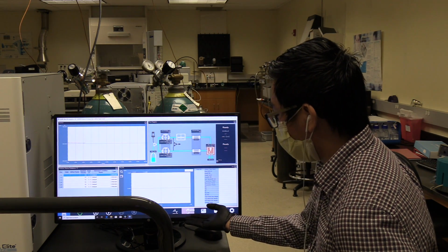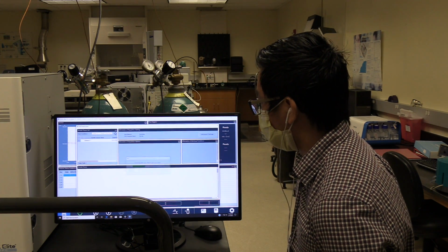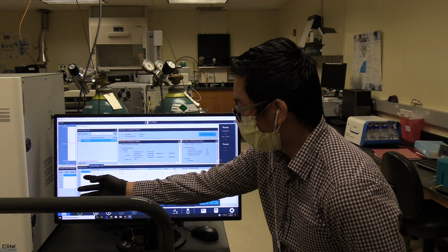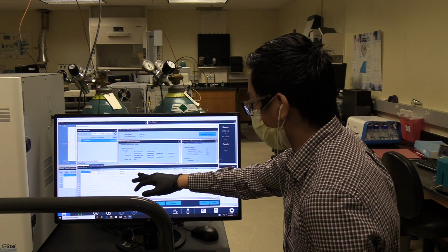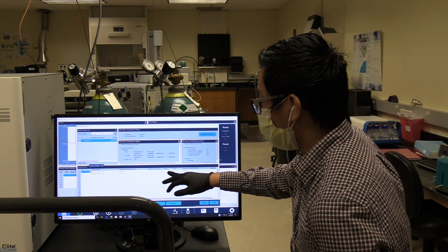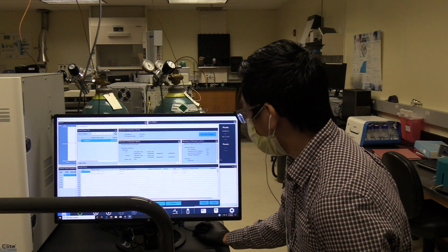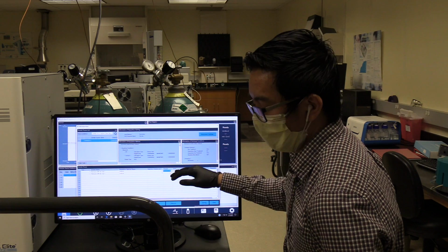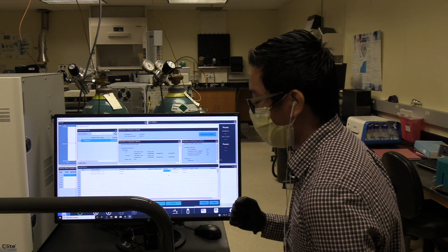Here, the next button to the right would be to do your sample queue. Upon clicking your sample queue, you will be able to generate your sample list. So like I said, you're going to enter your cup, which is your vial location, the name of your sample, your acquisition name, your injection volume. Here we are using 10 microliters. The number of times you would want to repeat an injection on the same line. So if I were to do 1 here, I would inject 1 time for this line. In the event that I want to do 3 injections in this 1 line, I would set 3.